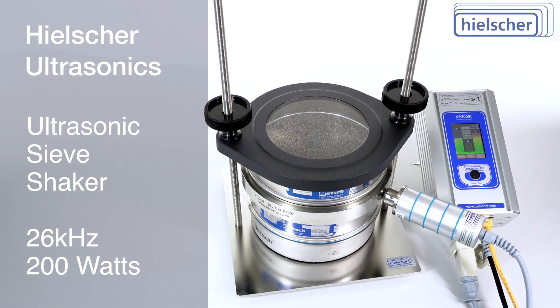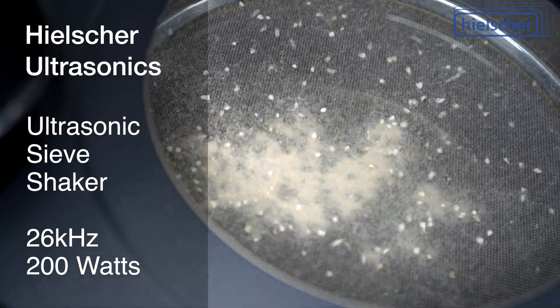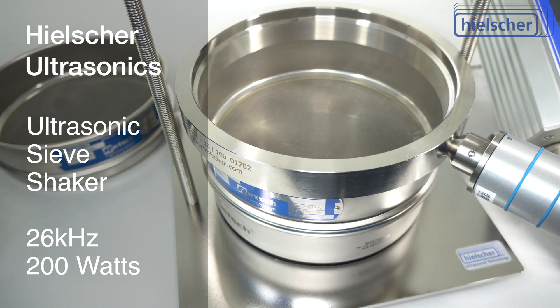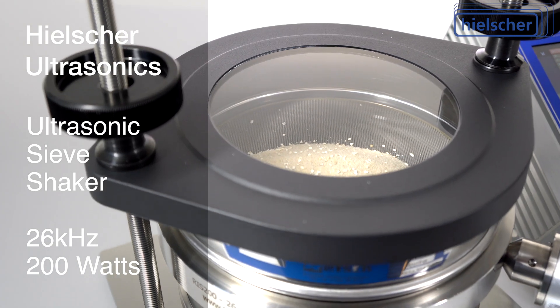The ultrasonic sieve shaker for laboratory sieves fractionates, classifies, or separates powders quickly and reliably. The ultrasonic ring is simply clamped between standard lab sieves or test sieves. The ultrasonic vibrations are transmitted to all sieves in the sieve stack.